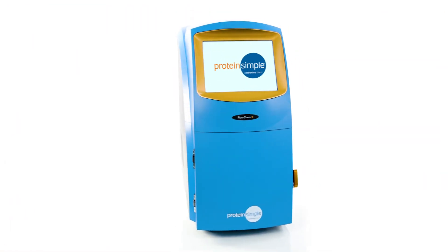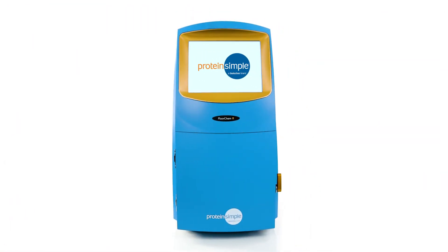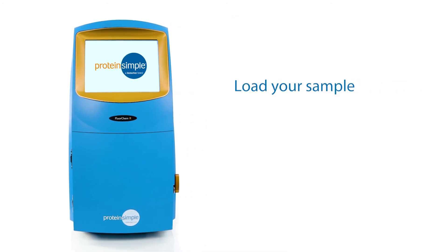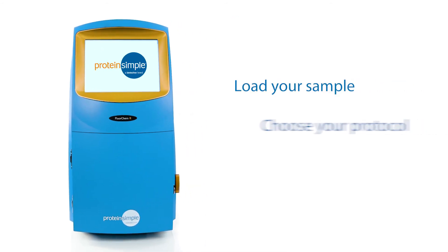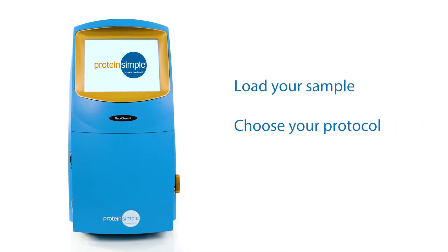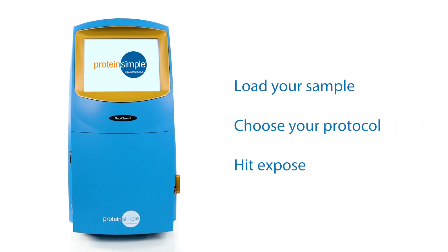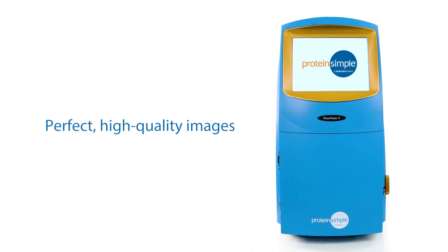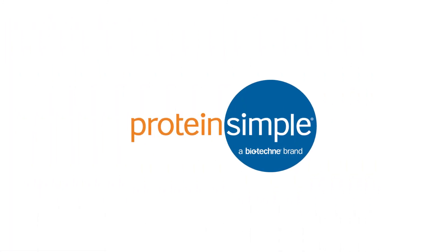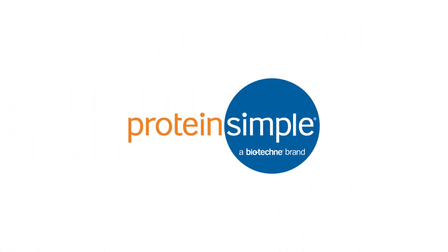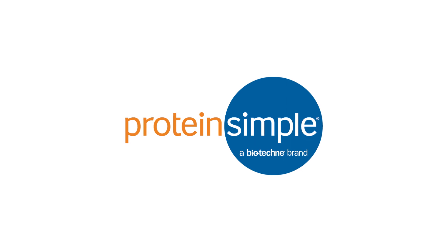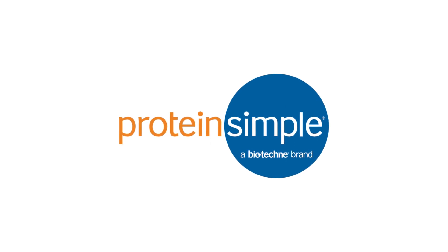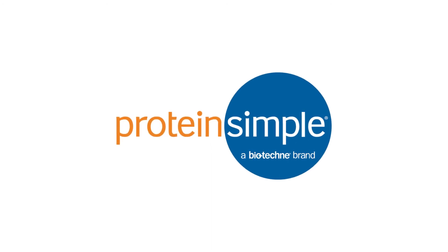FluorChem Imagers make gel and blot imaging a breeze. Simply load your sample, choose your protocol, and hit expose to get perfect, high-quality images. To find a FluorChem Imager that fits your budget and applications, please contact the Protein Simple team.